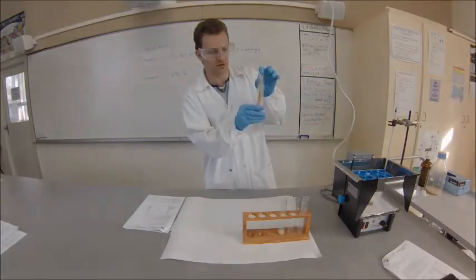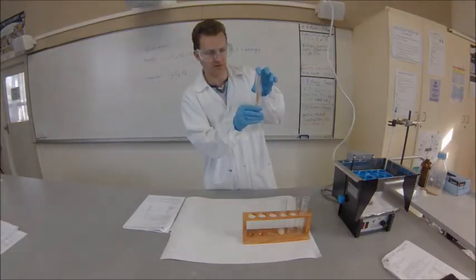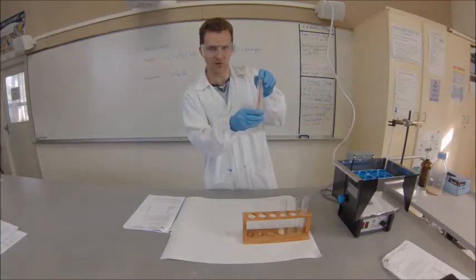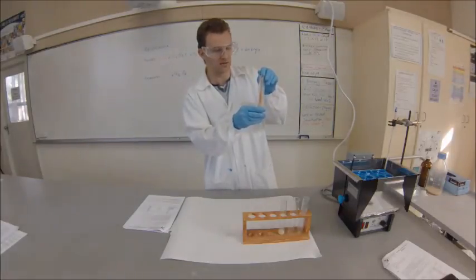Ignore the bubbles - don't include them in the measurement. Look at the bottom of the meniscus, which can be a little tricky. That's why we do this in triplicate to account for those sorts of errors.